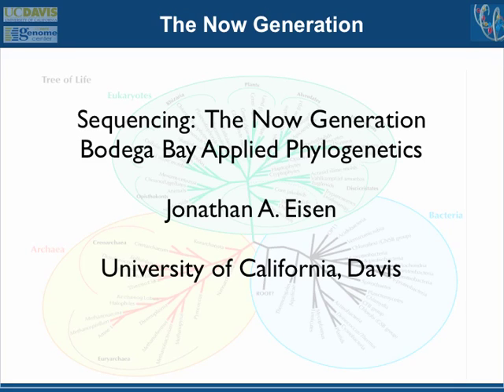But I'll give a little bit of sort of the history for people who can see the progress. So before I moved to UC Davis, I was at a place called TIGR, the Institute for Genomic Research, which was the place that sequenced the first genome of any organism in 1995. I wasn't there when they did it, but when I moved there, we had about 100 fluorescent automated sequencers. That was the cool thing, and now a single, $100,000 desktop machine outstrips all the capacity that we had back in 1998. So it's been completely crazy.